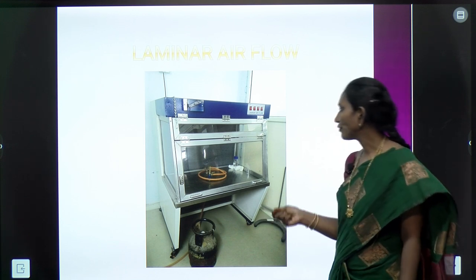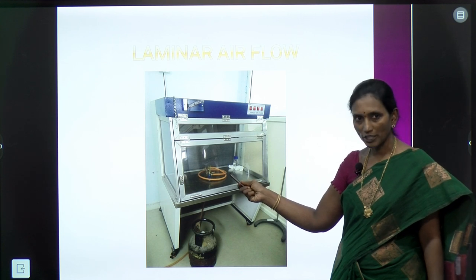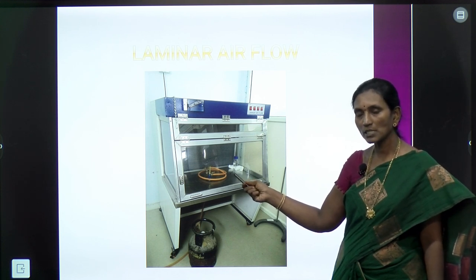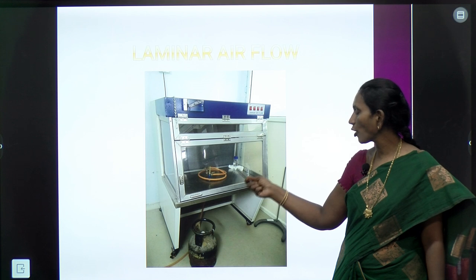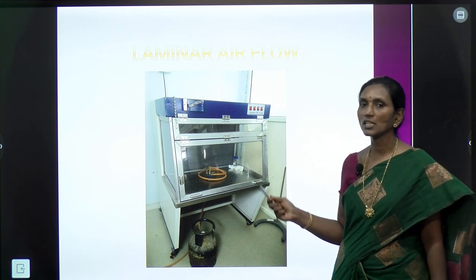This is the photograph of laminar airflow chamber. Inside this glass chamber, inoculation is done. Inoculation means transfer of sterilized explant onto the sterilized nutrient medium by using some sterilized instruments.